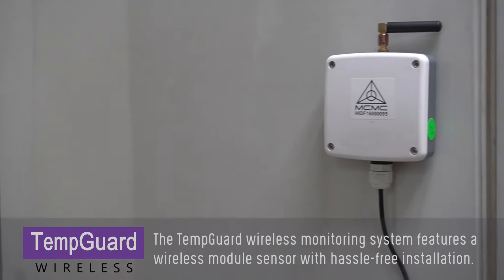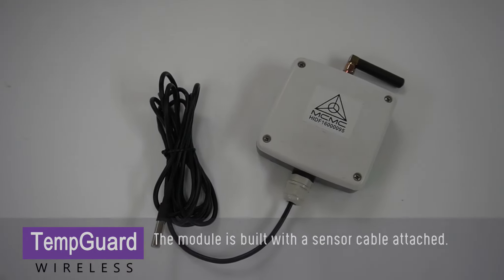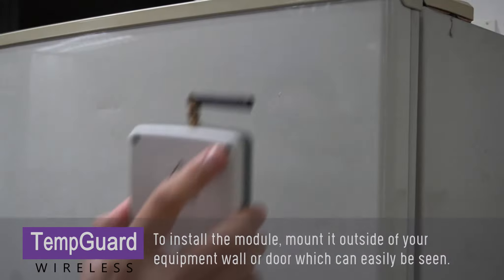The Temp Guard wireless monitoring system features a wireless module sensor with hassle-free installation. The module is built with a sensor cable attached. To install the module, mount it outside of your equipment wall or door where it can easily be seen.